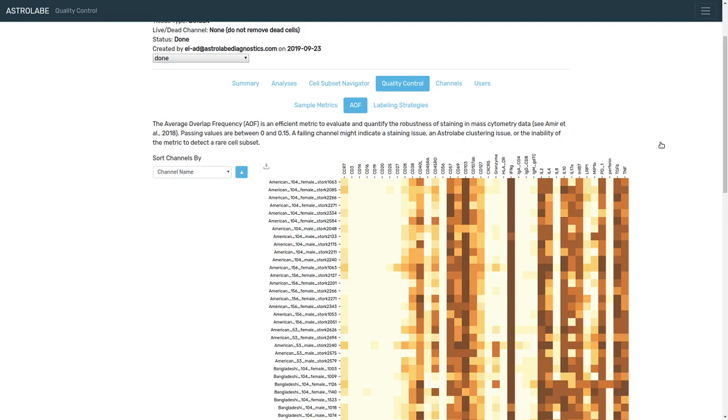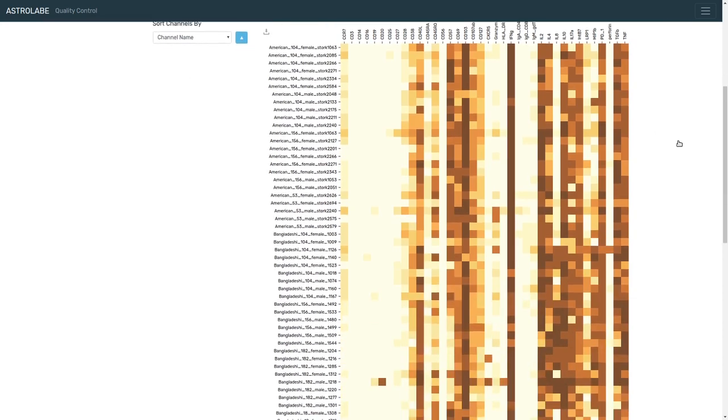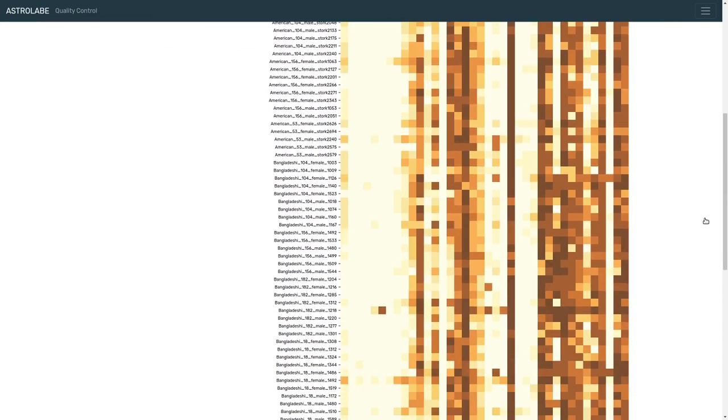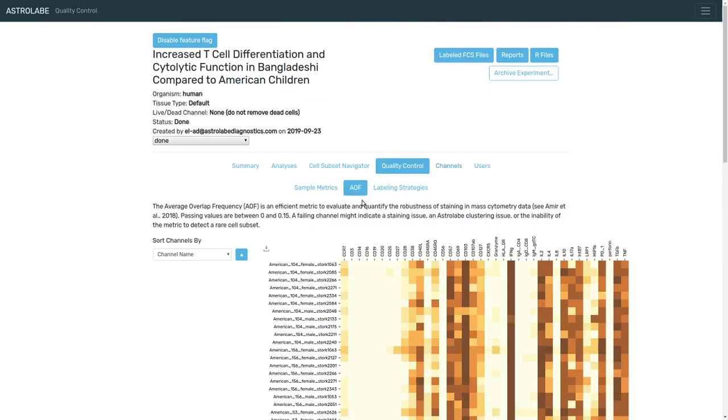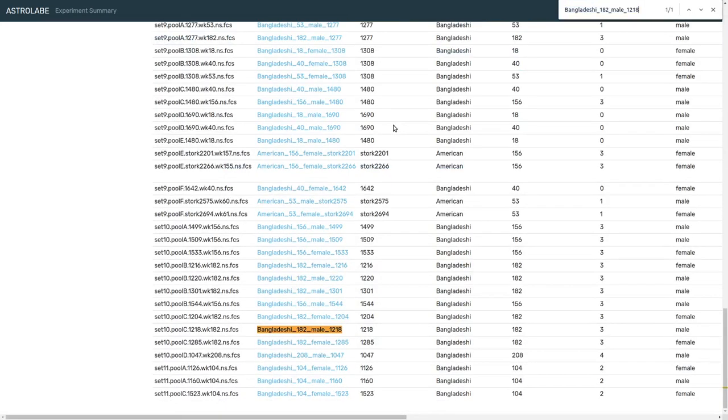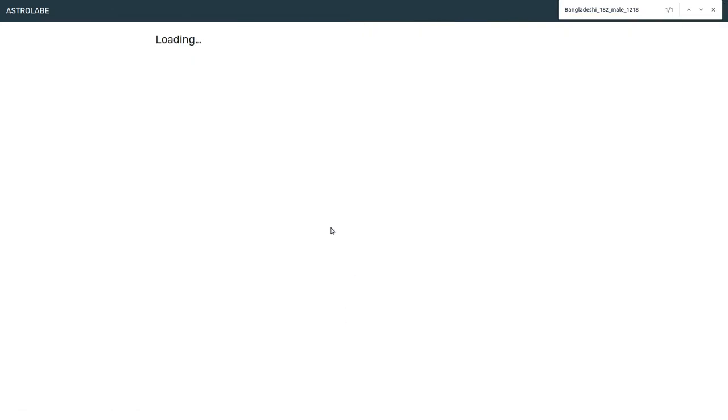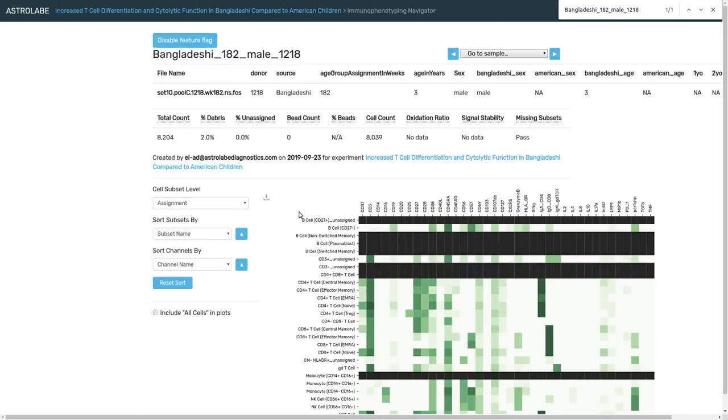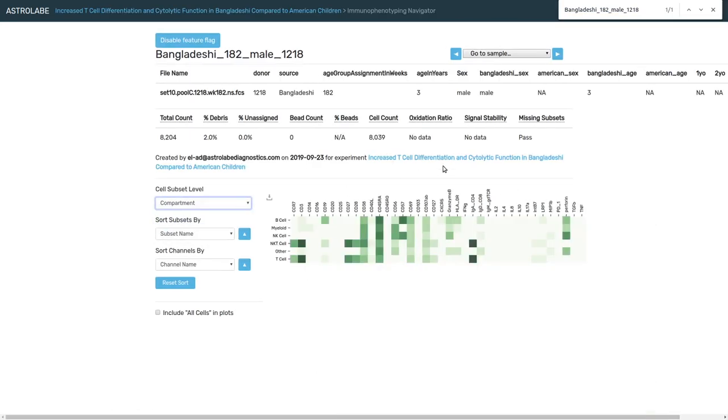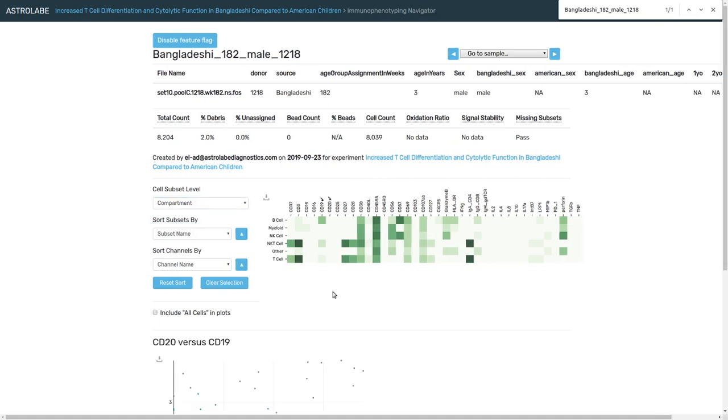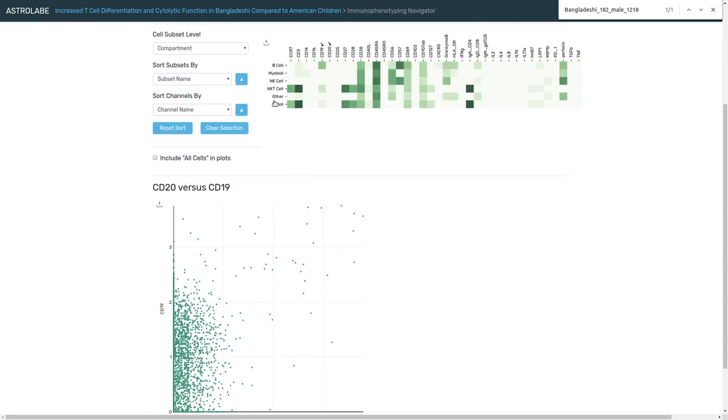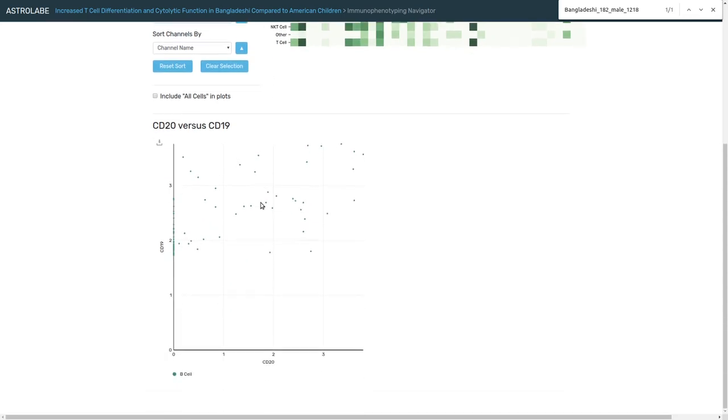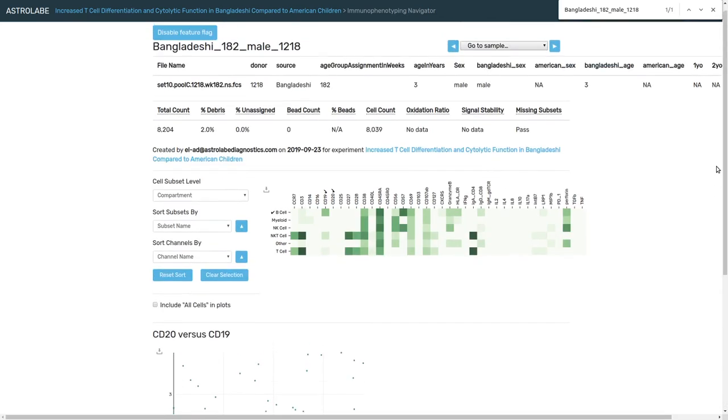Just by using this heat map, we can quickly scroll down and see that one of the samples has an issue with CD20. If we mouse over it, we see CD20 has a pretty high AOF. And if we go to Astrolabe's immunophenotyping navigator and enter that sample, we can look at CD19 versus CD20, and then scroll down and see that there isn't much of a correlation between them. If we look at the B cells, their CD20 distribution is pretty spread out.